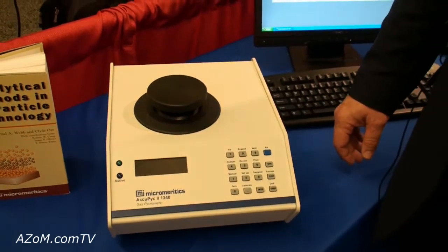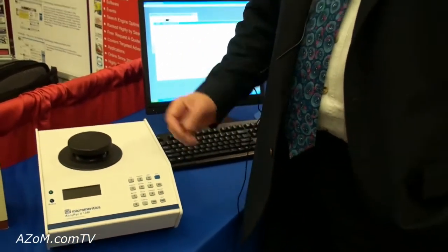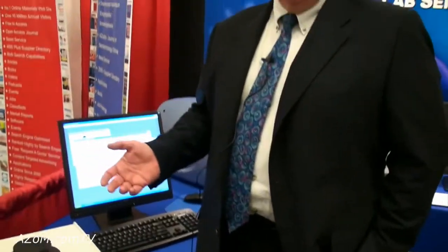And what's a typical time it takes to take a measurement with the 1340? The 1340 is very flexible in terms of the number of tests that you will perform. In the example that you saw here, 10 tests, probably less than 30 minutes. A lot of times, people in a quality environment want to get a quick result for production control. And you can do one or two tests and have it done in under five minutes.